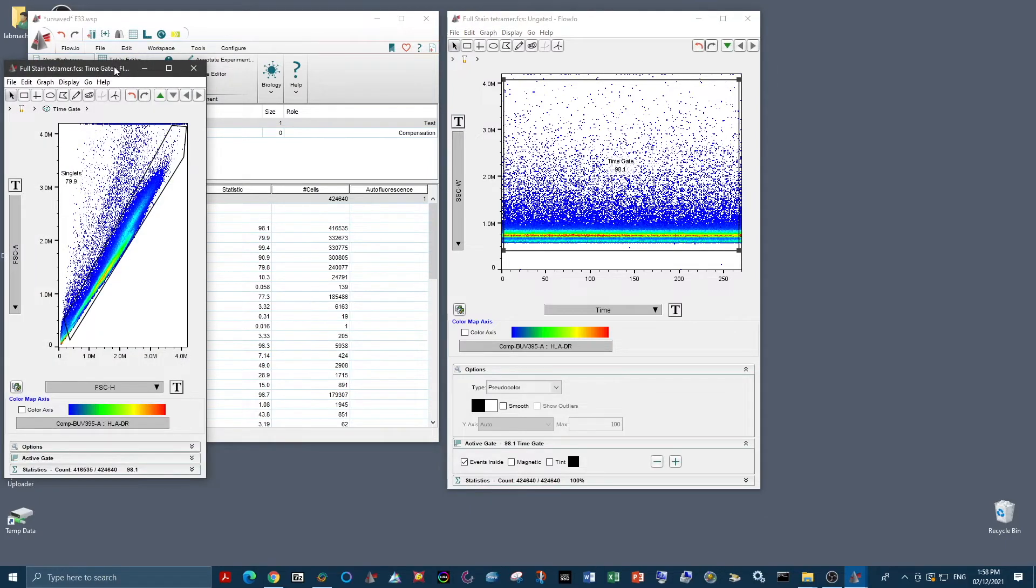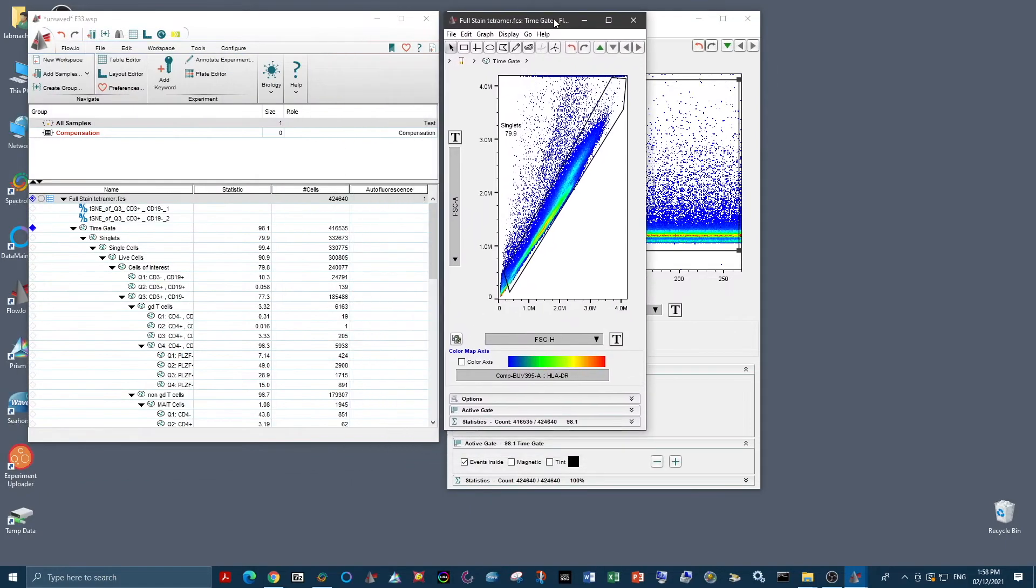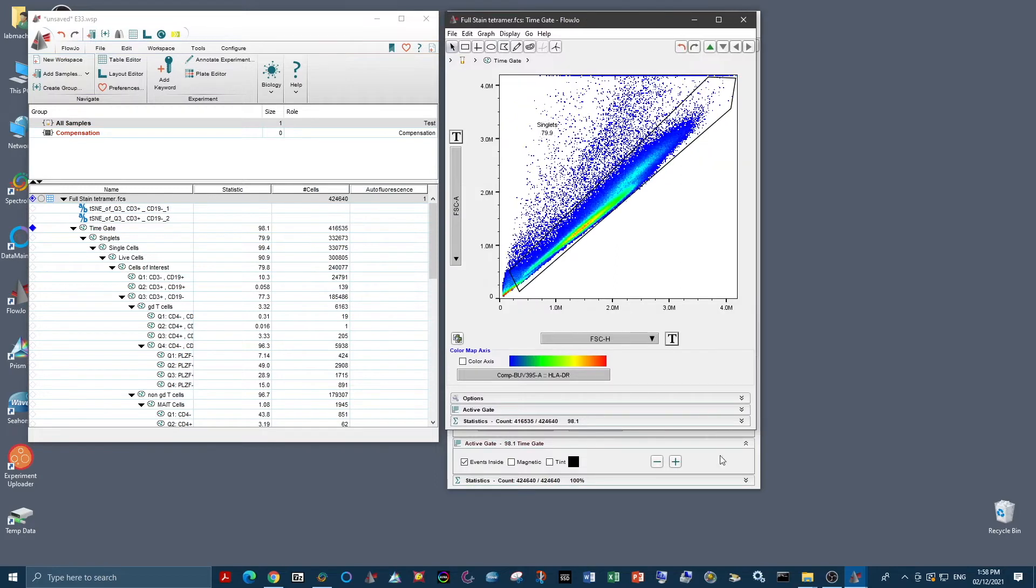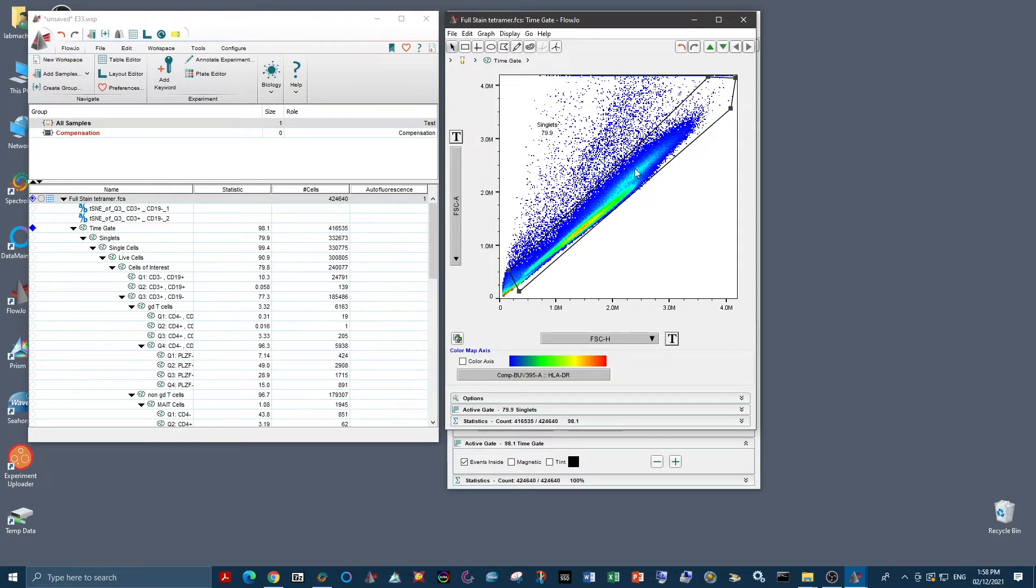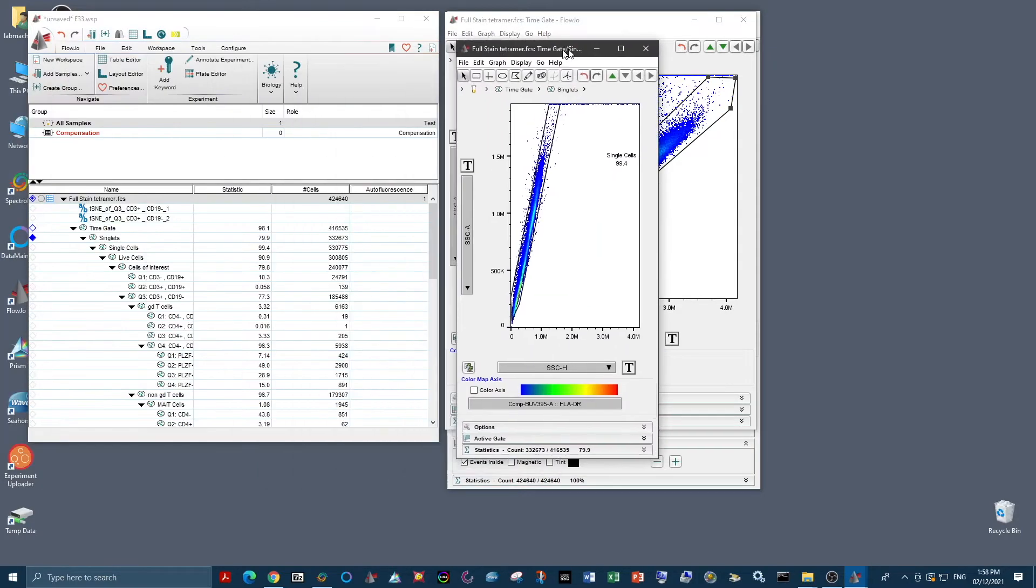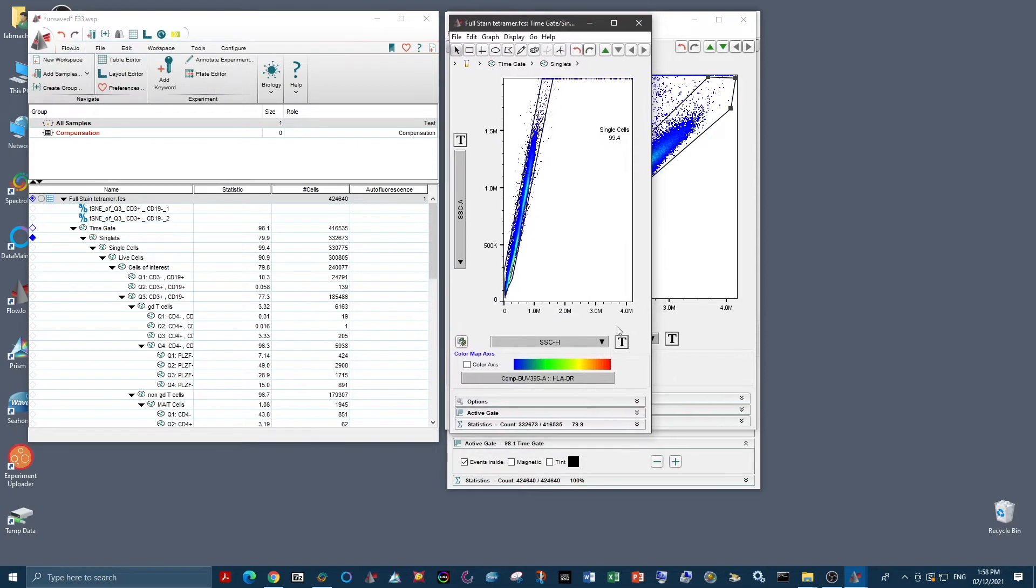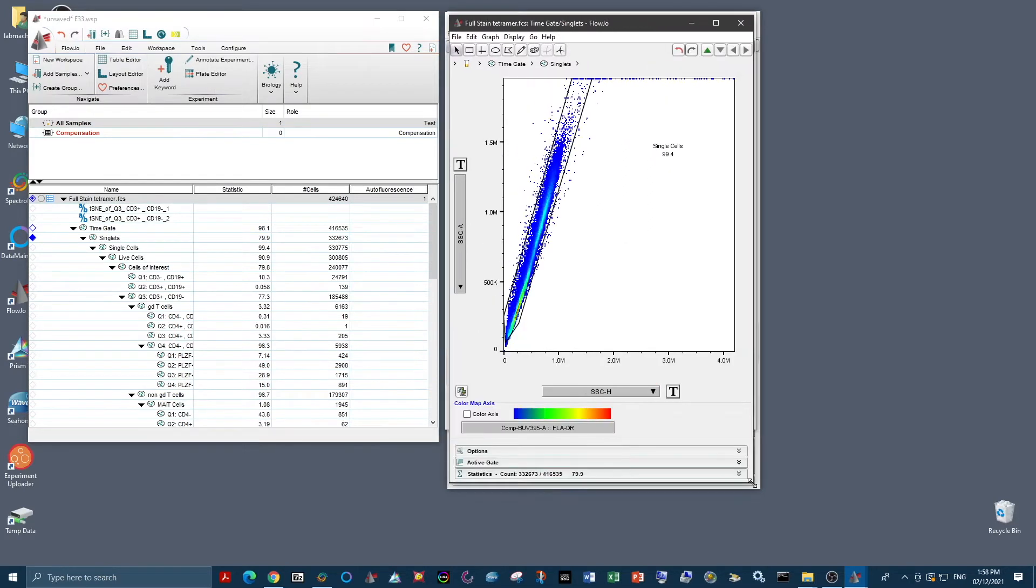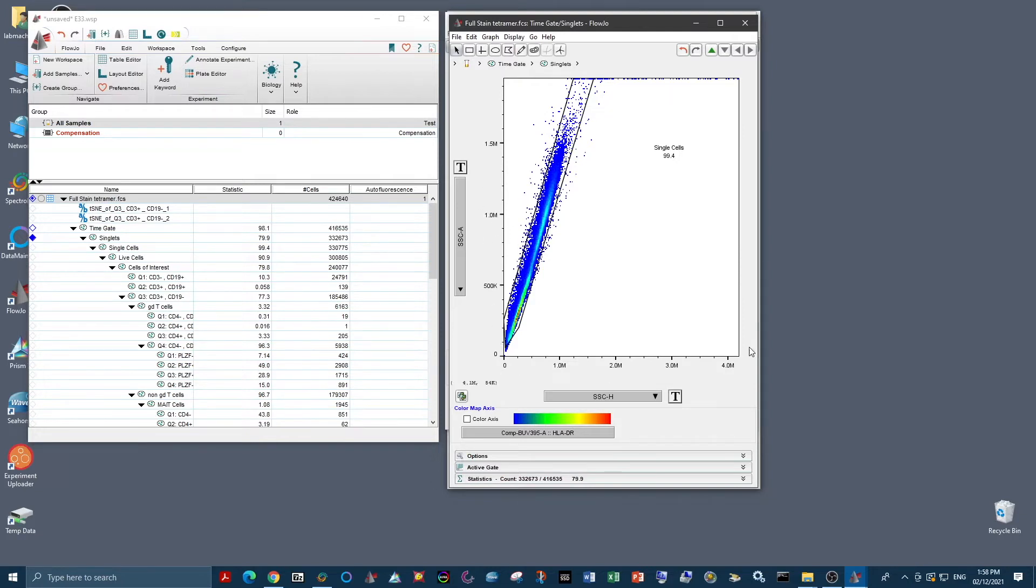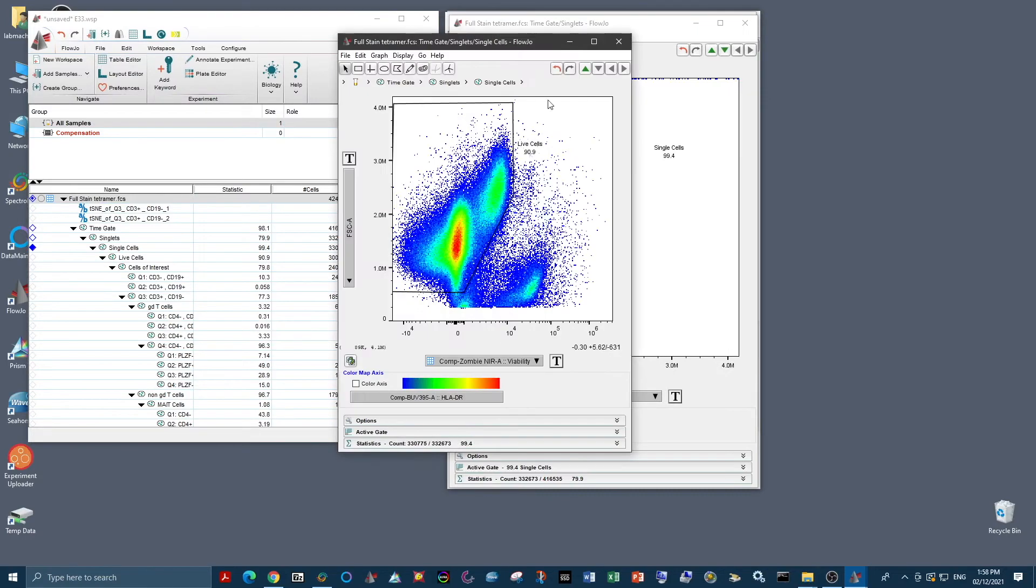If we drill down from this, we of course want to do our singlet gating. So we've put forward scatter height versus forward scatter area and taken only the events on the 45 degree diagonal. From here we have moved down to do our singlet gating based on side scatter height versus area, and again, only taking the diagonal population. The scaling is a little strange here, which is why it's not nicely on the diagonal.